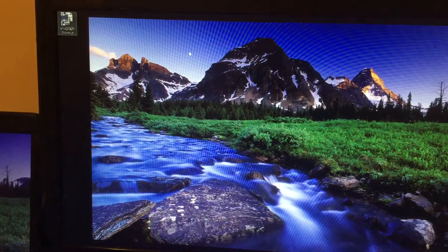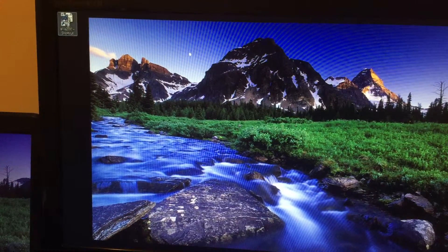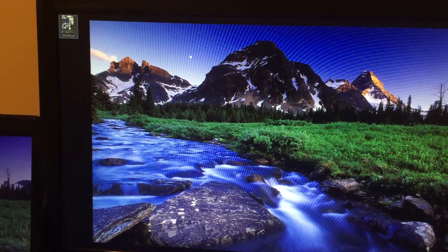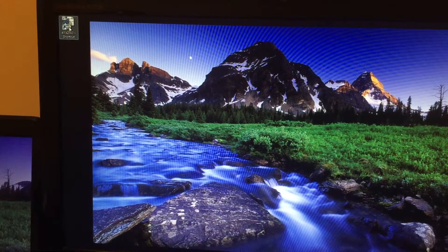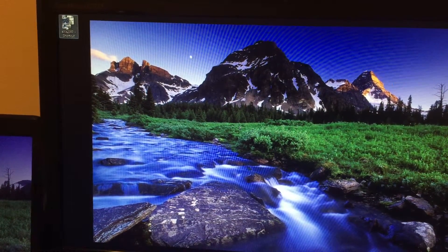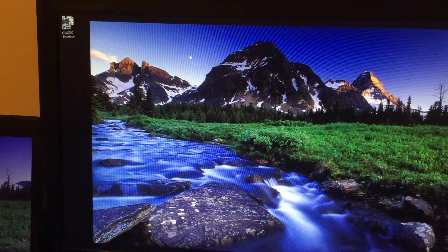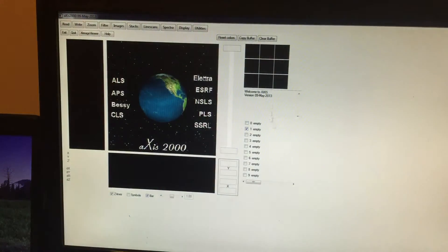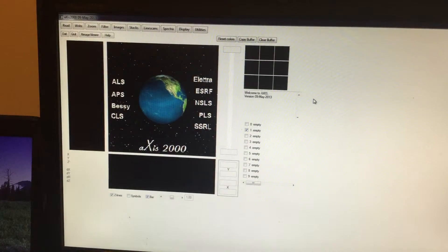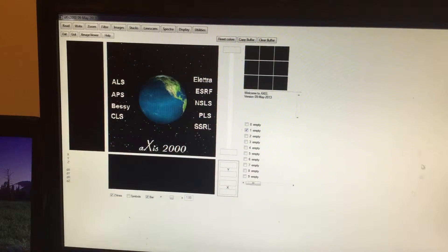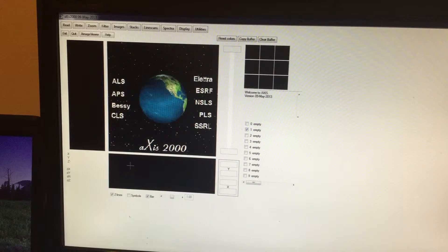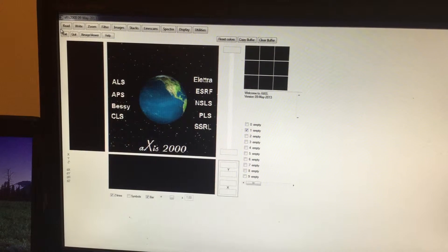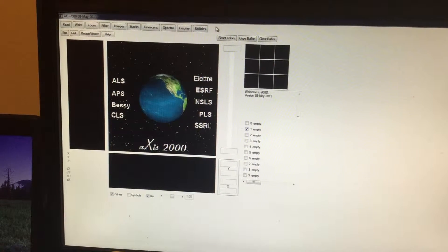Here is the Axis 2000 software. This is the icon corresponding to Axis 2000, so if you click on that, this window will pop up. This is the front panel of Axis 2000, and you have many options here.